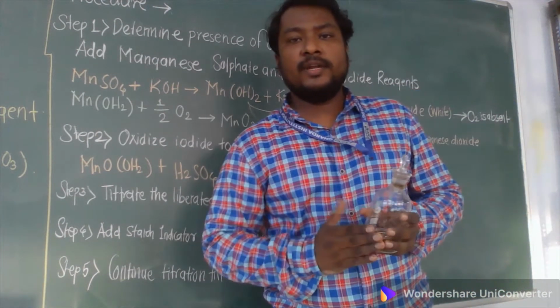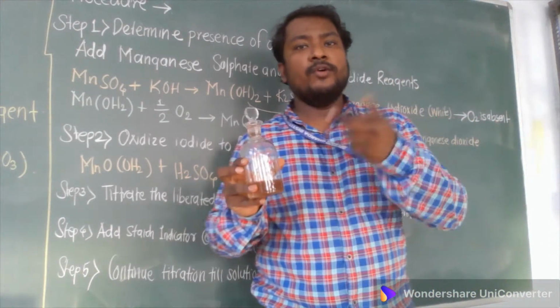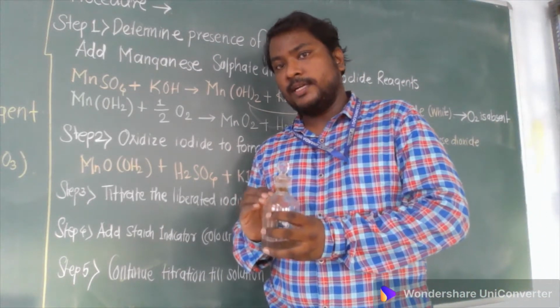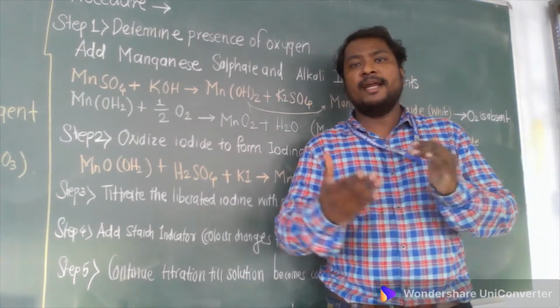This bottle is known as the dissolved oxygen bottle. In this dissolved oxygen bottle, we are going to perform this experiment, and all the chemical reactions you are going to observe will take place in this bottle. That bottle we will use for our analysis.